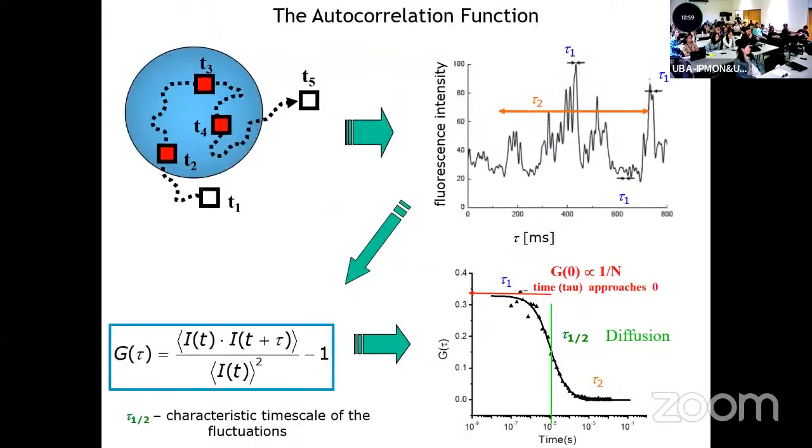So we'll know this value. You can see by eye 0.3 something. Yes. So you can fit this to get the G when tau is equal to 0, right? So when we do the fitting, you'll have a G of 0.